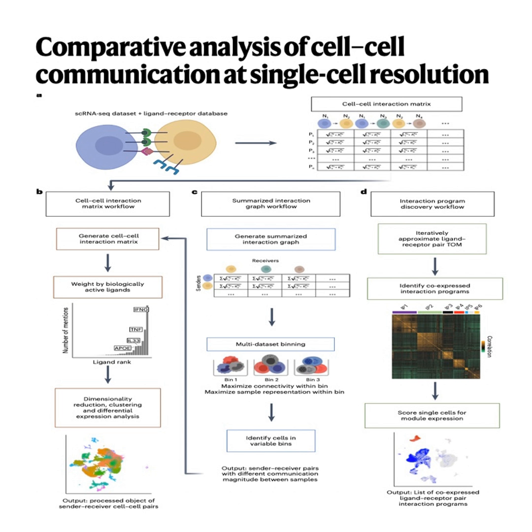So an agglomerative method, which needs to define an exhausted T-cell cluster to analyze its communication, would likely miss them or average them out with non-exhausted cells. Precisely. It wouldn't see them as distinct communicators. But Scriabin, working at the single-cell level, saw the difference. It did. By calculating that CCIM, looking cell by cell, it found clear differences.